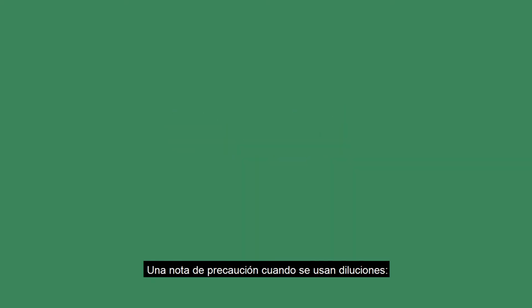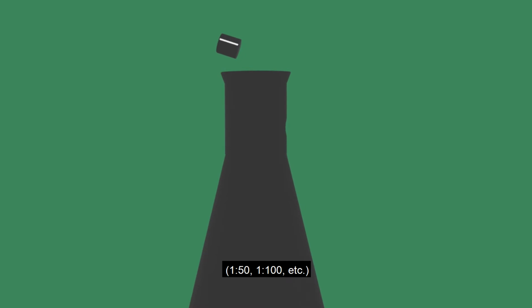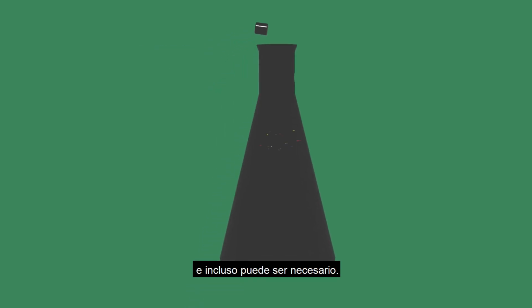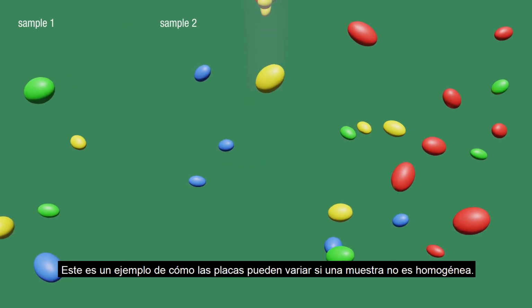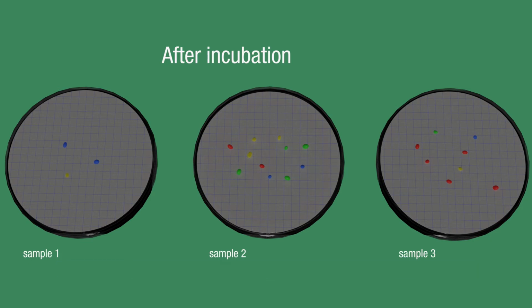A note of caution when using dilutions. Testing small amounts of sample in large amounts of sterile buffer, 1 to 50, 1 to 100, etc., is possible and might even be necessary. However, increased dilution makes ensuring a representative sampling more difficult. Here's an example of how plates can vary if a sample isn't homogeneous.